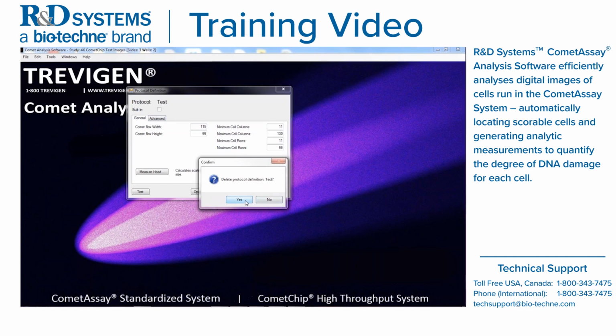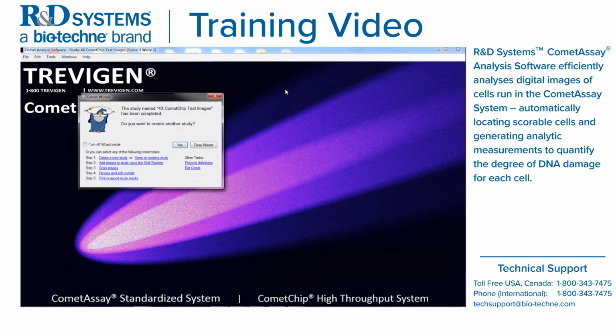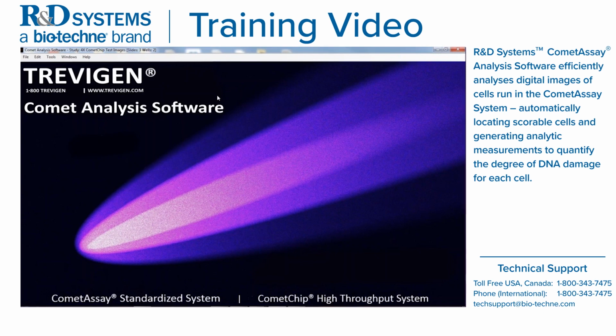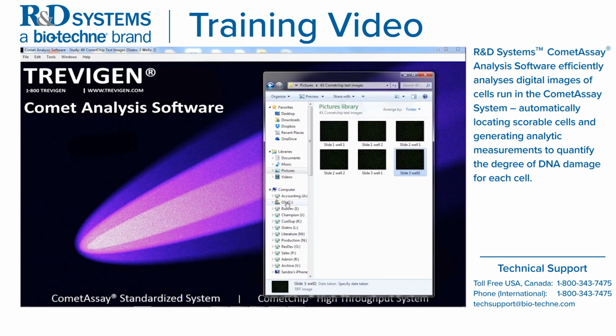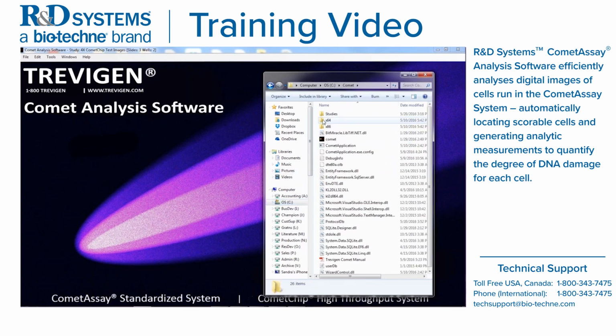One important thing that I'd like to note is, when you create the study folders, which is basically your specific experiment that you're saving your images to, the data also for each comet is being saved to that folder. These folders can actually start to get fairly large. They're actually stored on your C drive, so on your computer. So if you select C, there's a Comet folder here, which the software always looks for. Within Comet, there is a Studies folder, again, which the software always looks for.